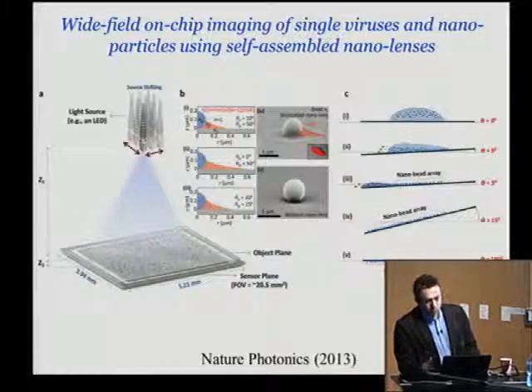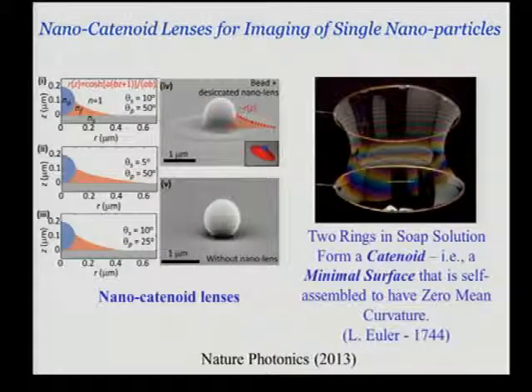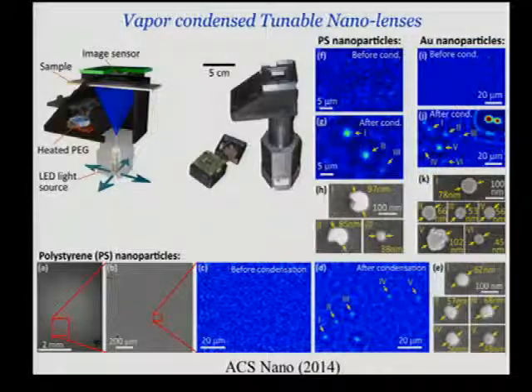Your detector is overwhelmed by the background light. To solve this kind of problem, we borrowed tricks from self-assembly, and we created self-assembled nano-lenses around nanoparticles to essentially increase their signal-to-noise ratio. This is the work that one of your new professors has pioneered, and this is the work that, as a postdoc, he did before coming here to push the limits of this system to the level where we can see sub-100, sub-50 nanometer particles.